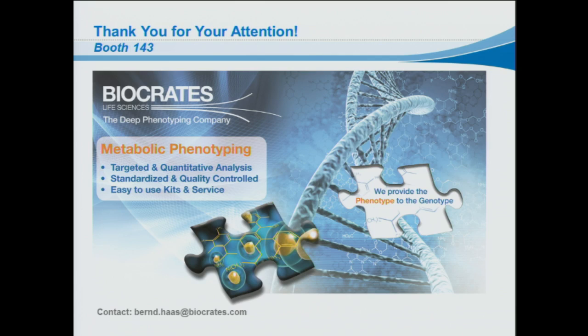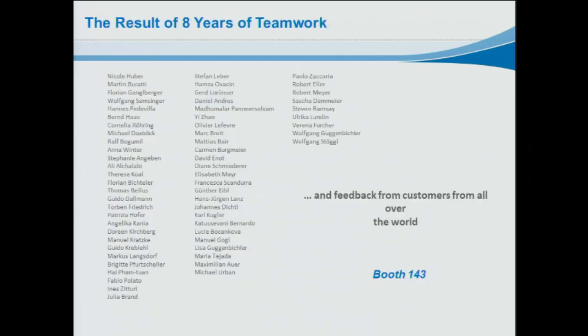Well, what you have seen now is an overview of the complete workflow and software that we offer in combination with our kit. As you see, we have tried to radically simplify it and to make metabolomics as usable and easy as possible for the science community, so that we have more time to do rocket science. If you are interested in seeing the software live, you can come to our booth. Thank you very much.